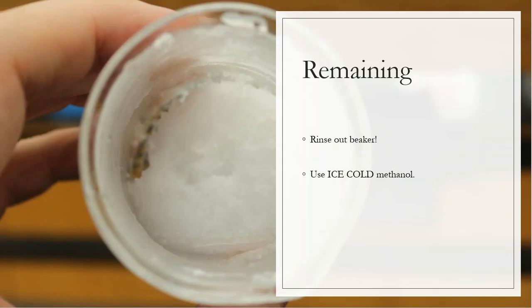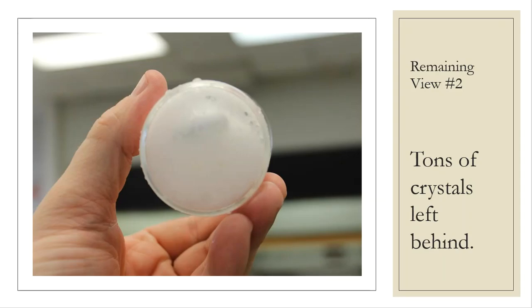All right, so once I pour all of my solution through, here's my beaker. And I have some residue that's left over in that beaker. I need that residue out because this is the clathrate that's here. And that clathrate has my organic unknown component. And I want to make sure that I transfer all of that over. All right, so here's the bottom view of that beaker. As you can tell, there's quite a bit. I can also still see the magnet that is there as well.